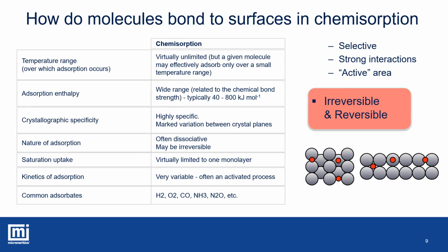In this table, we report the main conditions at which chemisorption occurs. The gas and solid nature and the temperature lead to the phenomena of chemisorption or physisorption. Inert gases are mainly subject to physisorption at cryogenic temperatures. On the other hand, when an active solid, like a metal-supported catalyst, and a reactive gas are put in contact at a relatively high temperature, chemisorption takes place. The energy involved in this case is related to a chemical bond. Thus, a chemisorbed molecule gives place to a different surface compound.